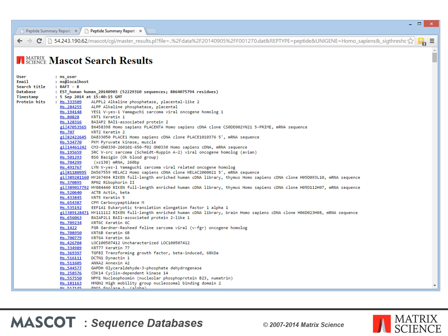This is now a much clearer picture, very similar to the protein database result. Please remember that we are not clustering the database sequences into consensus sequences prior to searching. This could lead to matches being missed. Unigene is being used after the search to map one set of accessions to a more useful set.